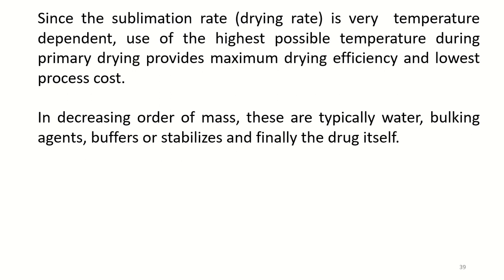These are typically water, bulking agents, buffers or stabilizers, and finally the drug itself. The bulking agent, which can be either crystalline or amorphous, and its interaction with frozen and unfrozen water in the frozen solution actually defines the physical structure which is essential to successful freeze drying.